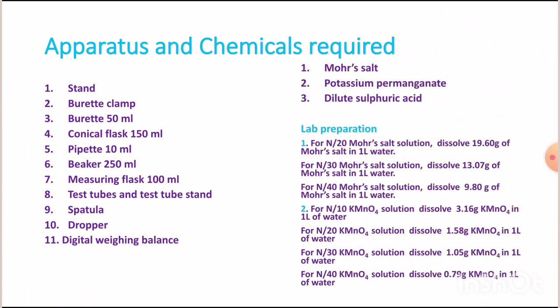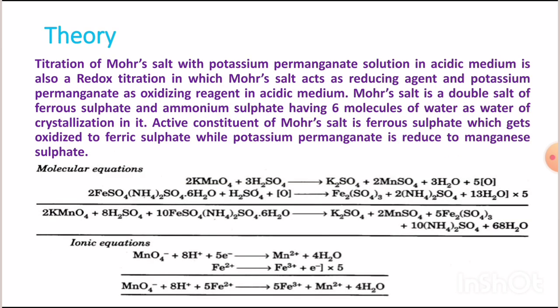Lab preparation for teachers. For preparation of Mohr salt solution and KMnO4 solution, different normalities are given here. They can supply any strength of these solutions to the students as per requirement.